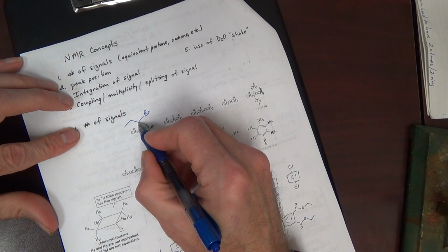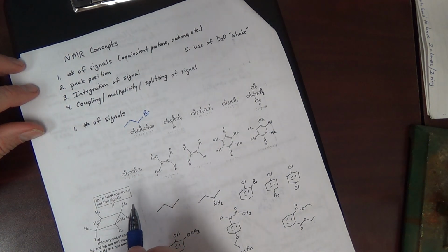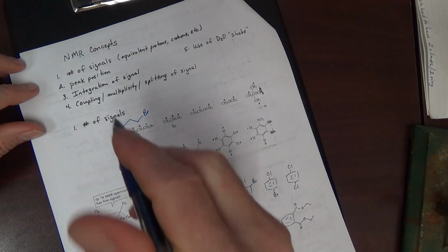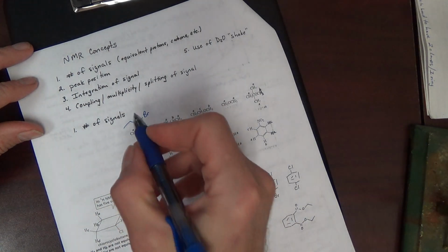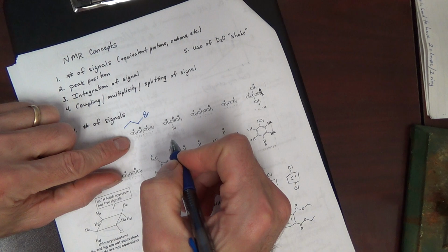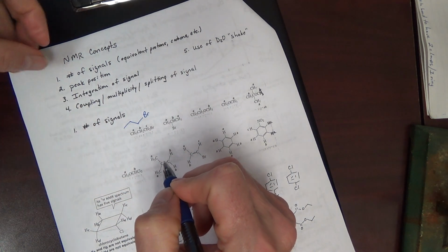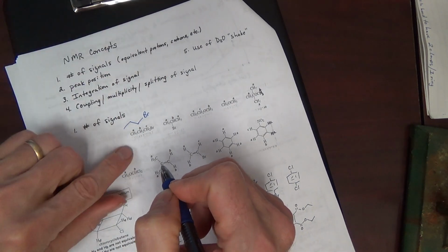CH3, 3 different signals here for proton. Again, we're doing proton NMR. Everything we do here early on is proton NMR, and you will know when we're doing carbon NMR. 3 signals. By the way, which signal should be most downfield? This is exact peak position, but we can talk about that.